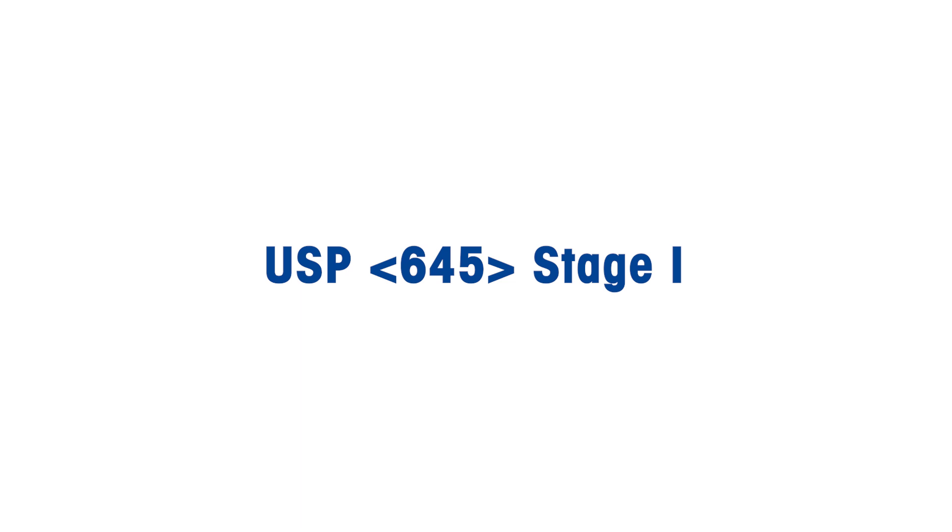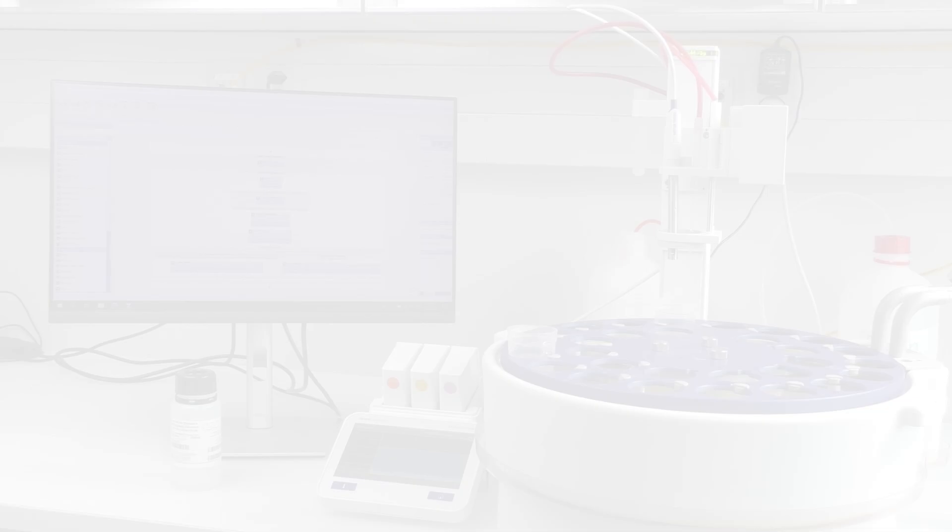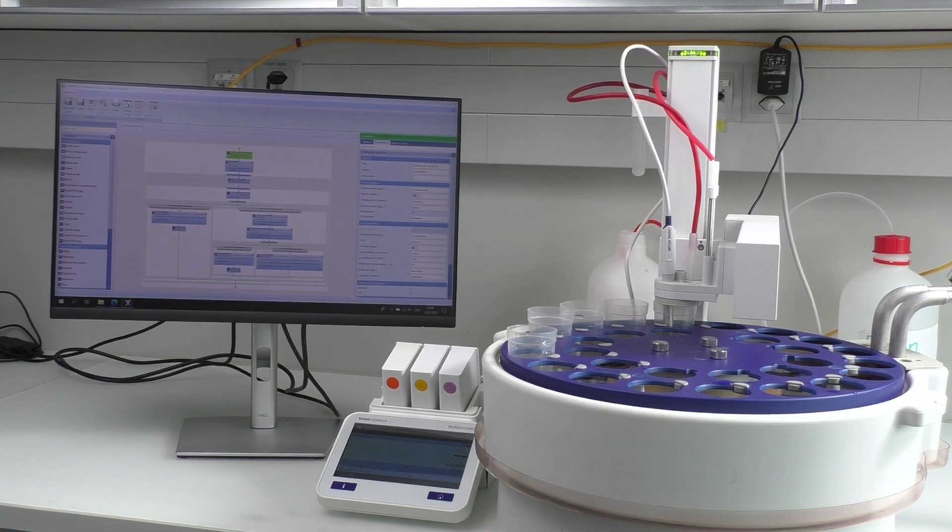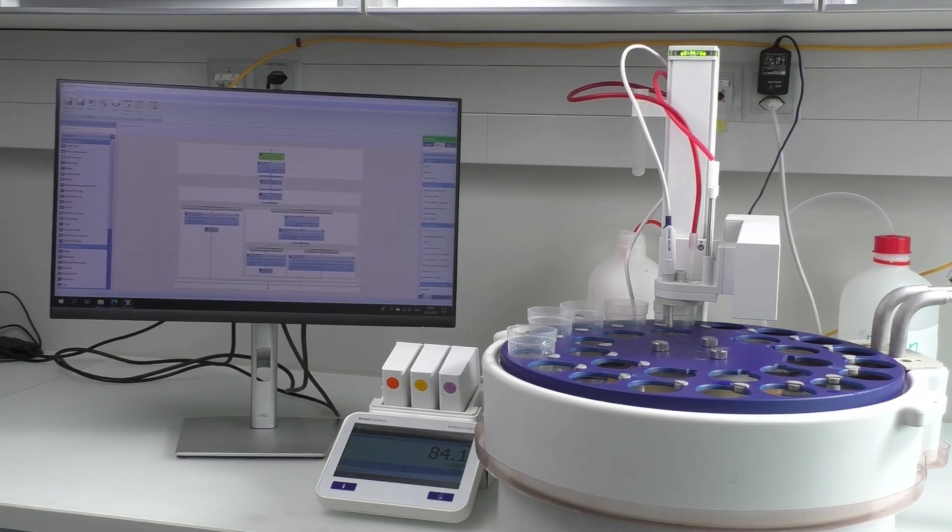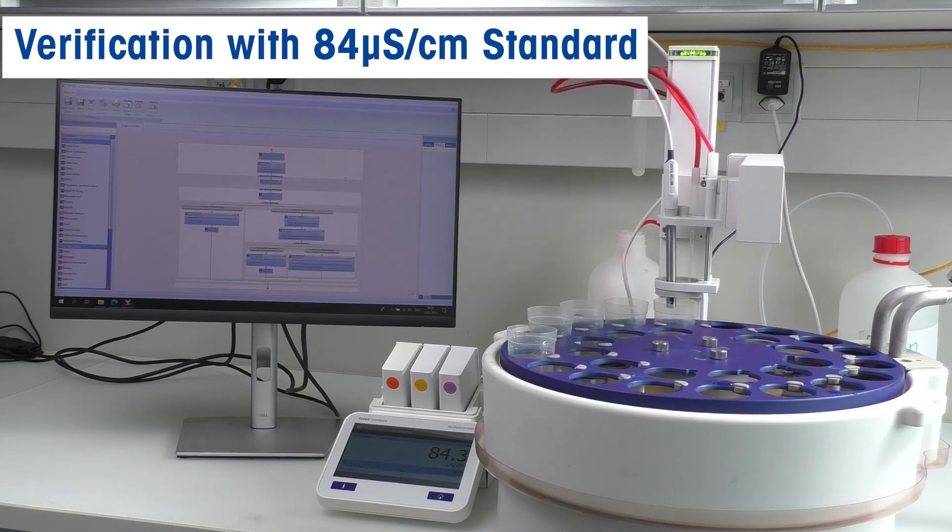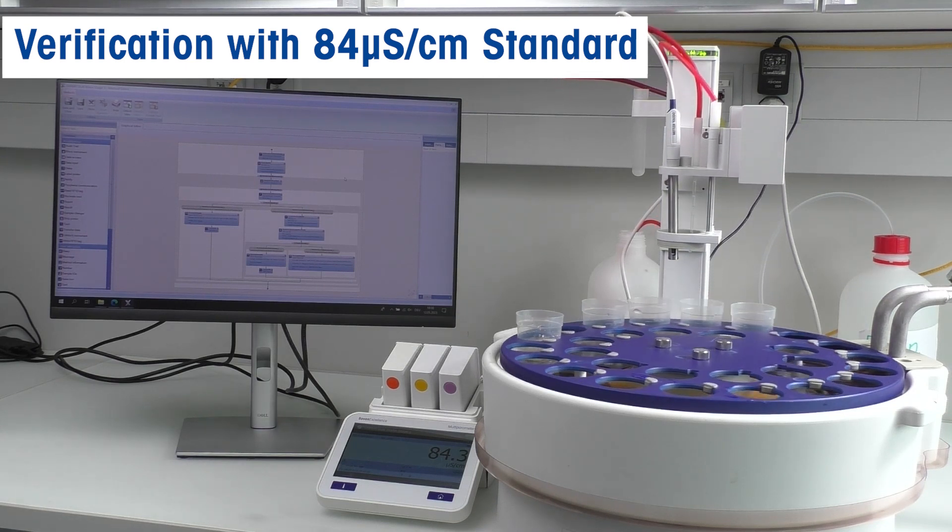Stage 1 requires determining the conductivity of water without temperature correction. As the in LAB-741-ISM sensor has a certified cell constant, we do not need to calibrate it. Only verification in 84 microsiemens per centimeter standard is required.